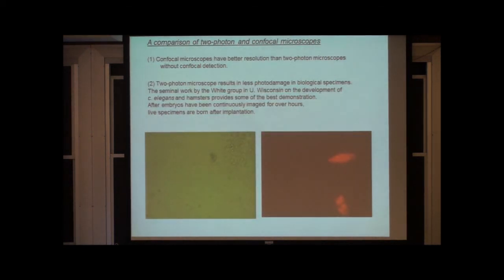So as I mentioned, what is good about multiphoton microscopy? One of them is three-dimensional imaging. The second one is this. You might not recognize this guy. This is a protozoa, a euglena. This is just a white light microscope. Soon I'm going to turn off the white light and turn on the UV lamp. Euglena fluoresce red because they have chlorophyll inside.